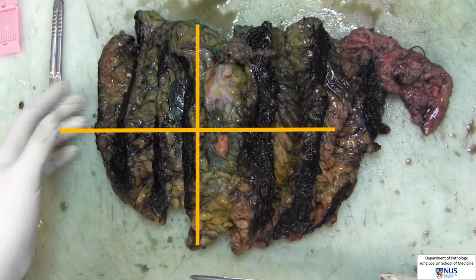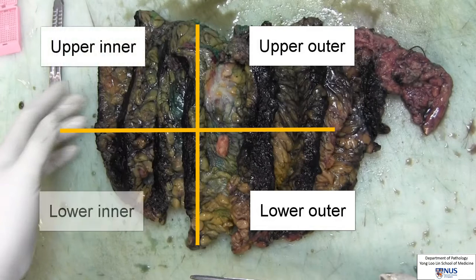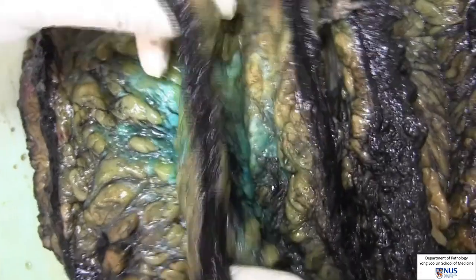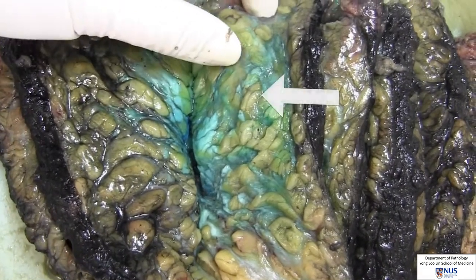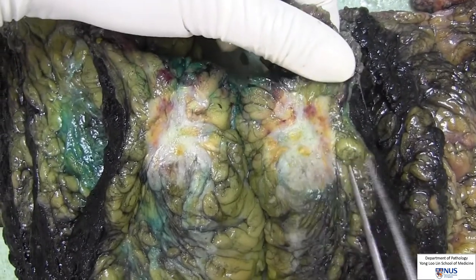The breast can also be divided into quadrants, namely the upper outer quadrant, lower outer, upper inner, and lower inner quadrants. The tumor in this case is located in the upper outer quadrant. Inspecting the breast slices, areas of fibrosis can be identified, suggesting fibrocystic change. Moving on, the tumor is a whitish, irregular mass infiltrating surrounding fat.